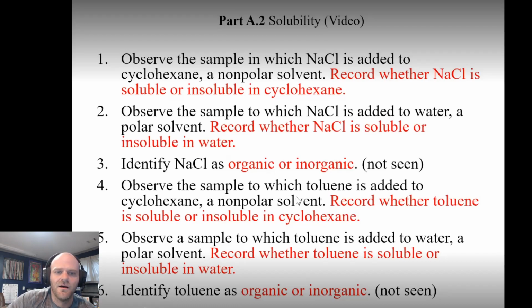Okay. Next up, observe the sample which toluene is added to cyclohexane, a nonpolar solvent, and observe the sample when toluene is added to water, a polar solvent. Again, identify toluene as organic or inorganic.